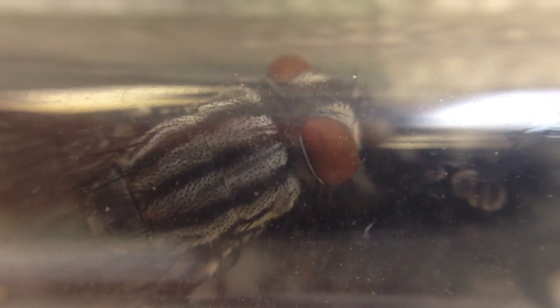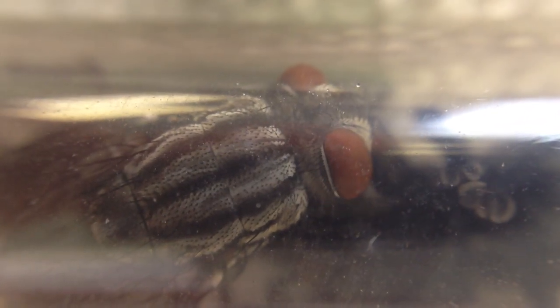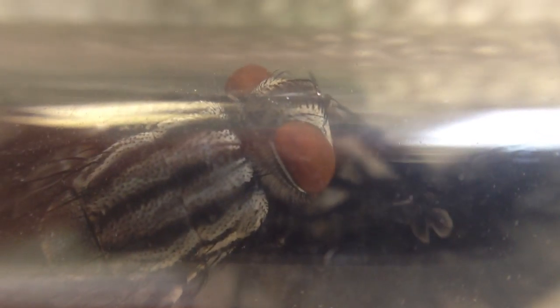Here's our close-up of these guys in a glass tube. These are the adults that came from the maggots that came from the turtles.